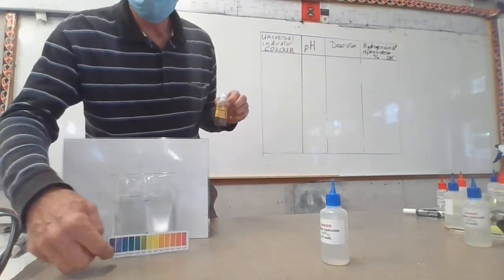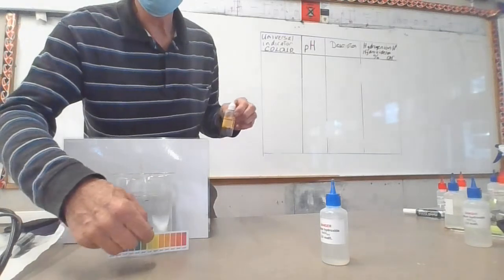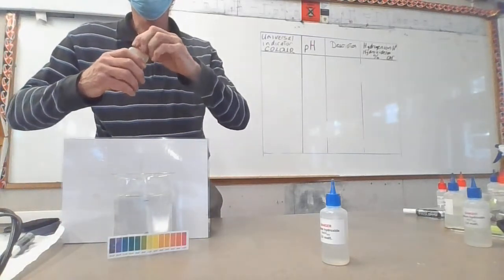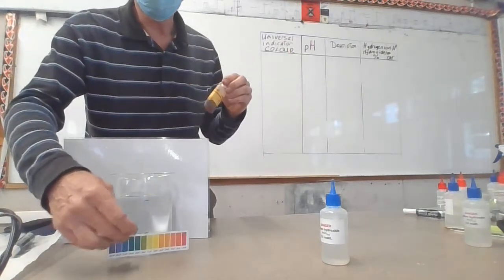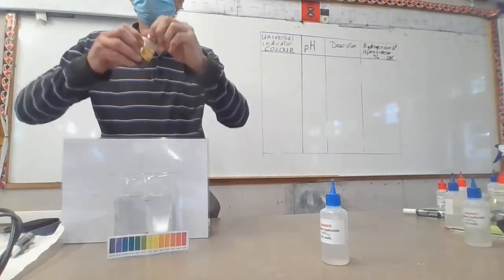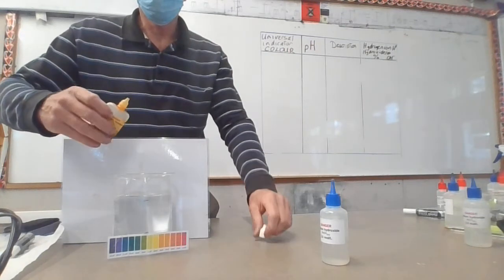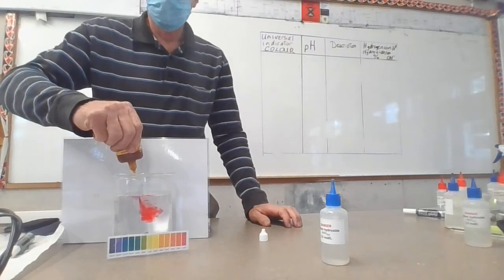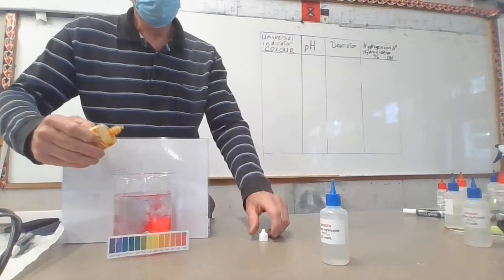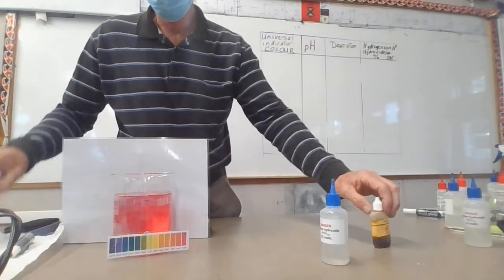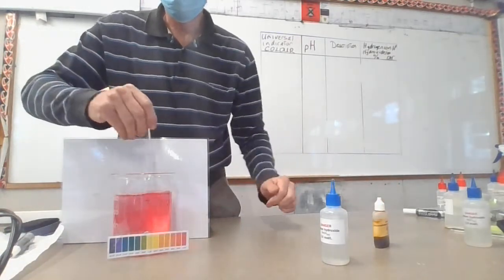This scale here is the pH scale. The colors are the colors that universal indicator will go as the pH changes, so we can look at the color of our solution and work out the pH. Putting in a good squirt of universal indicator into the beaker, we see that this is red, and red on the scale is a pH of 1 or 0.